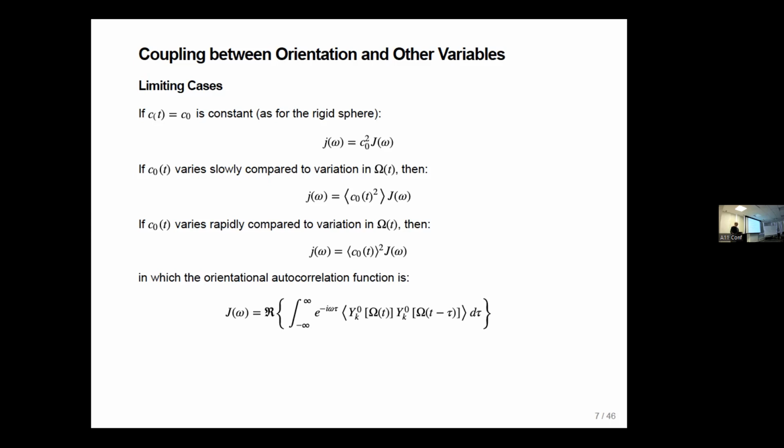Yeah. Ring flips. So aromatic ring flips can be quite slow in a protein, but they're fast enough that you usually only see one resonance. Say for the delta, you have two delta hydrogens, but you only see one resonance, because the flipping is fast enough on the chemical shift scale to average them, but slow on the tumbling scale. So if you have an NOE to some other proton, it might be closer to one of the delta hydrogens than the other. And then the ring flipping is averaging those distances.